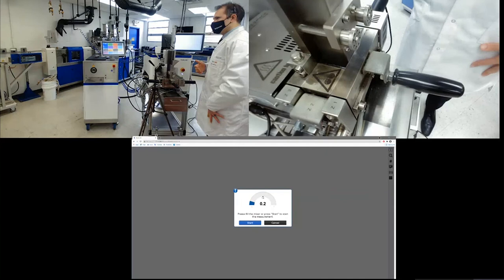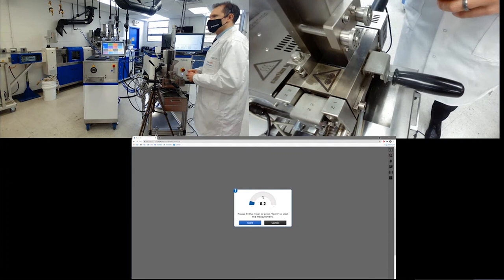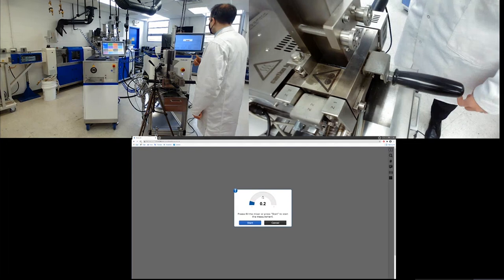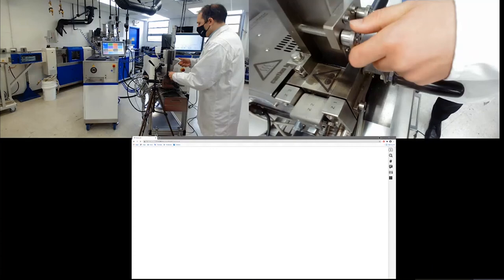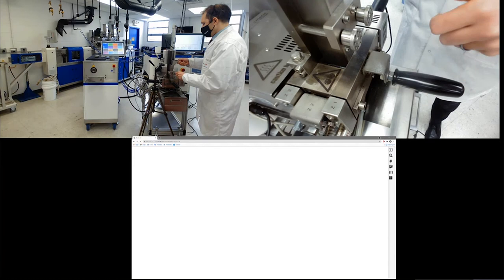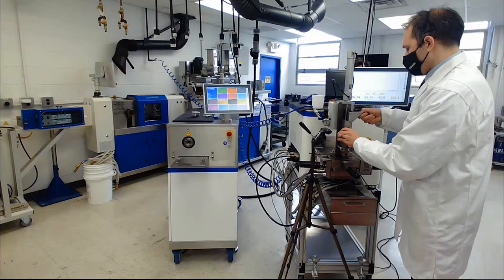It presses the sample inside. The torque will now start recording and as you can see in our split screen we have a beautiful loading peak as the material comes in. I think we might have to refresh the windows for what is going on on the computer side, or make this our prime one because the torque curve is now the most relevant one.